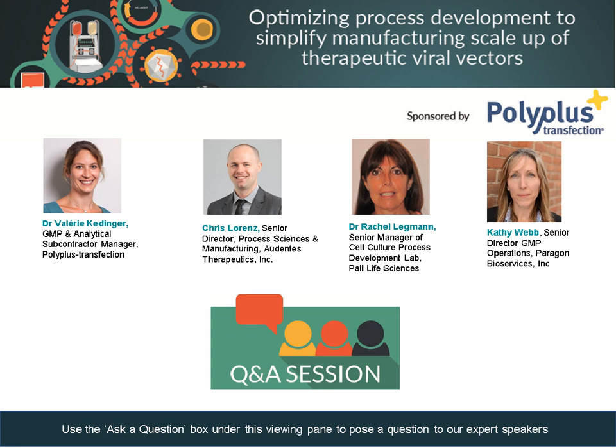And then, Alengo, did you want to give us your insights in terms of the approach from Polyplus in terms of PEIpro for adherent versus suspension? Sure, Eliza. So in my opinion, it really depends on the manufacturing process that fits best to the manufacturer, but even more so to each gene therapy product. And I think what we take into account is the fact that technologies by the manufacturers have already been developed. They've invested, for example, in in-house proprietary adherent or suspension cell lines.